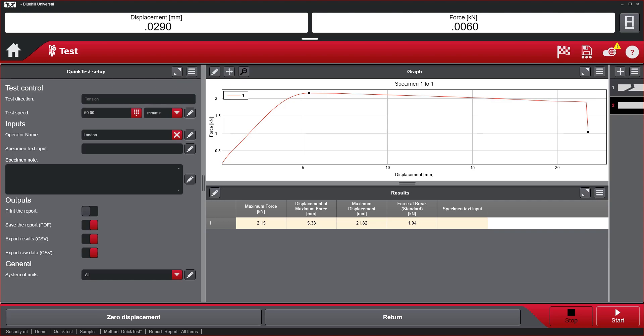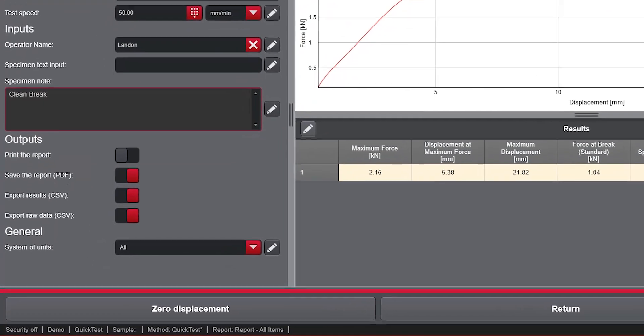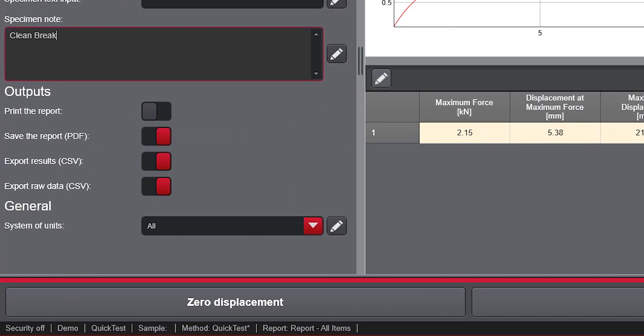With QuickTest, users have a predetermined set of results, including max force and displacement as well as force and displacement at break.